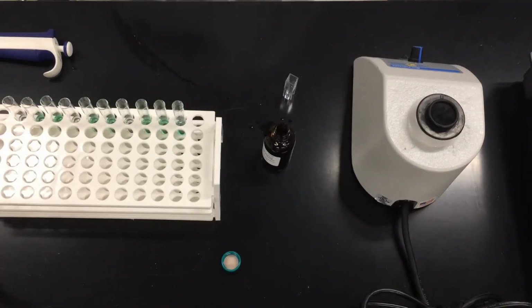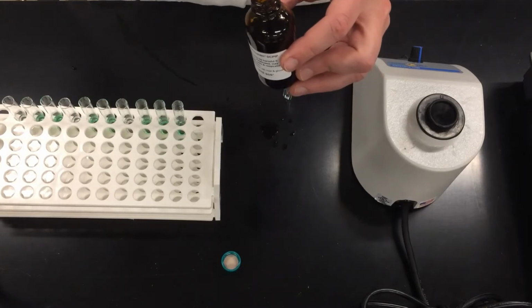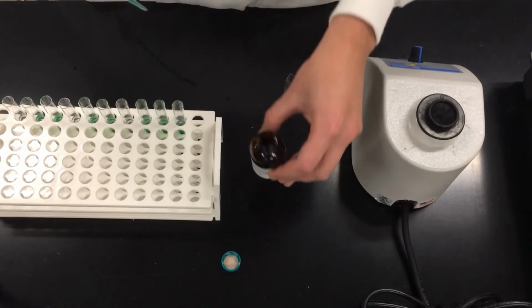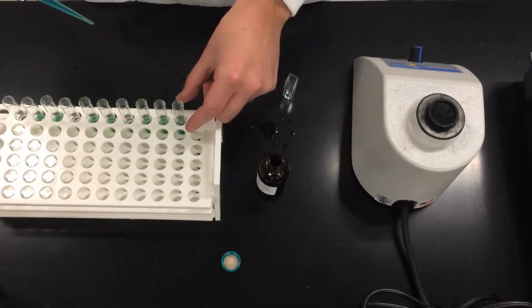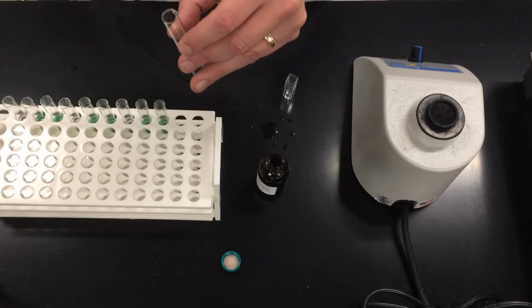Let's get to our experiment. Now normally the experiment would be done entirely in the dark because stray light from the room will affect the results of this experiment. But what I'm going to do is demonstrate this for you with the lights on so that you can see how the entire thing works. So if you see here I have my test tubes, I have the DCPIP. What I'm going to do is pipette 150 microliters of this. So if you take a look, there it is. It's a nice blue color. And I'm going to add it to my first test tube. So this one here will be the dark control.